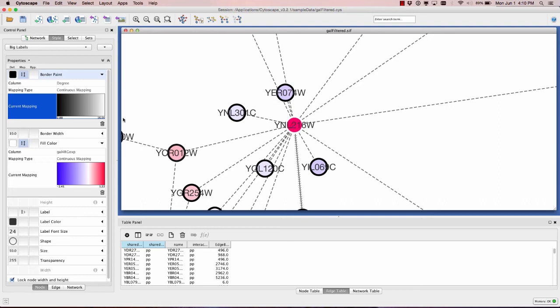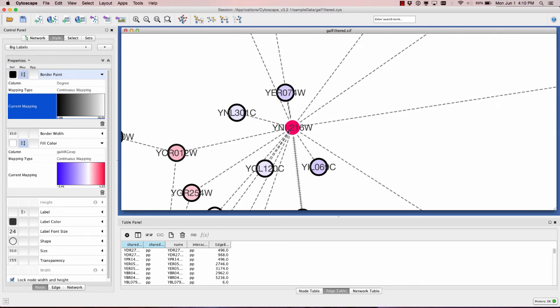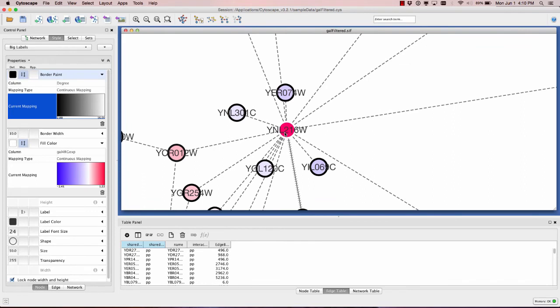You can also create charts - as I showed when I loaded up the GAL filtered session file, there were these little charts so you can show data over time or over multiple conditions.